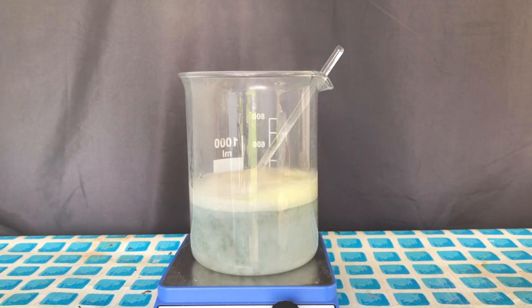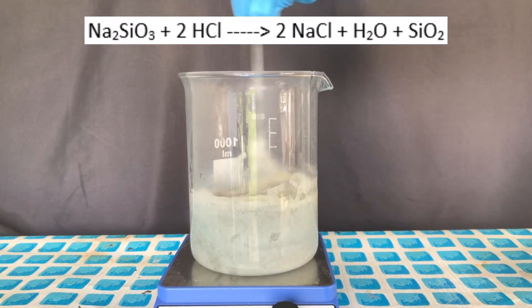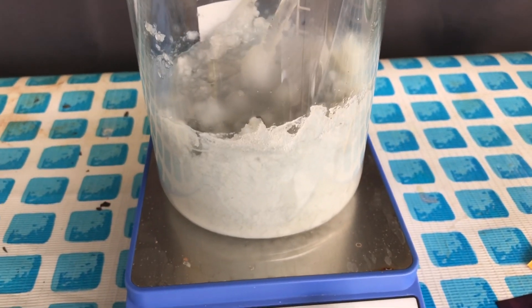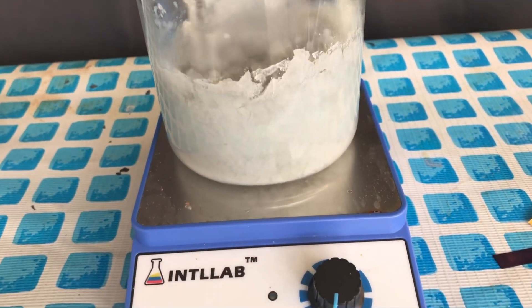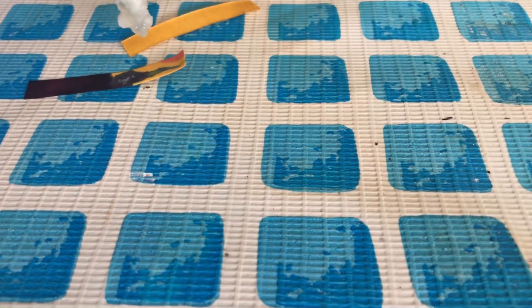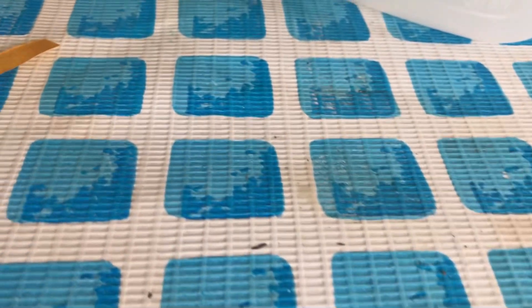The solution first turned clear and later on solidified into this strange gel. The reason it turned clear was probably that the dark iron hydroxide was turned into the much less colorful iron chloride. The gel is either silicic acid or silicon dioxide. I decided to test the pH and it was still strongly alkaline, because the pH strip turned dark blue.